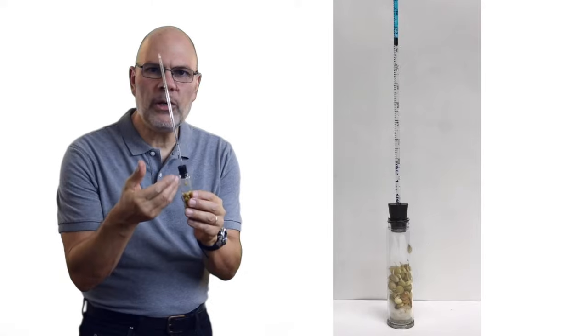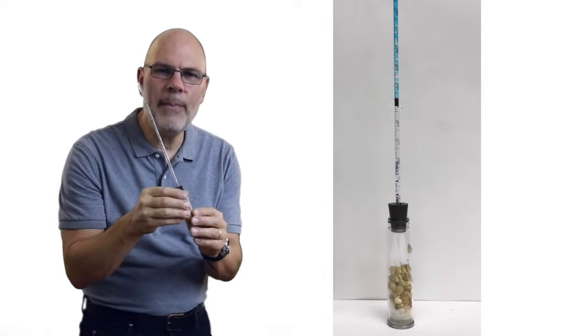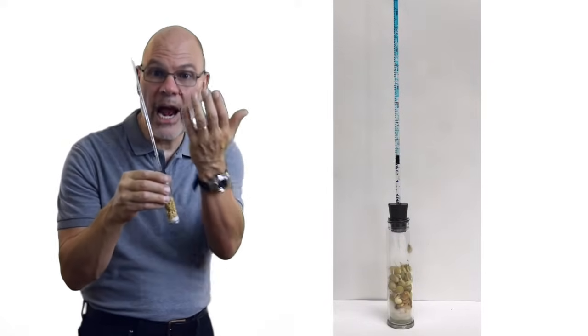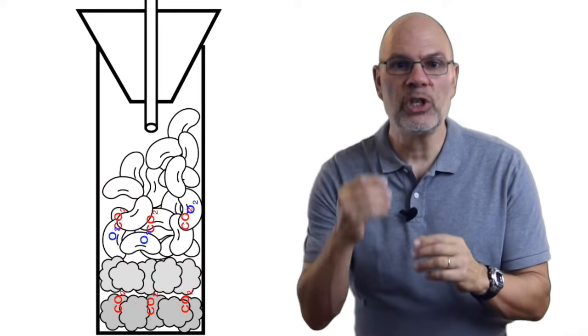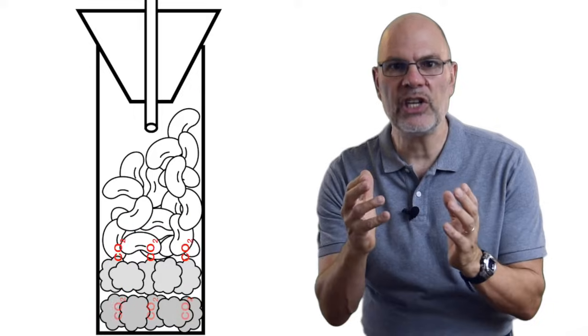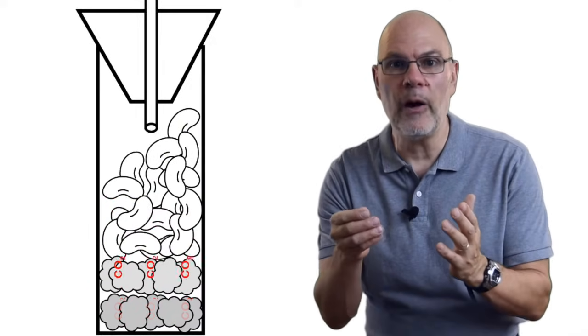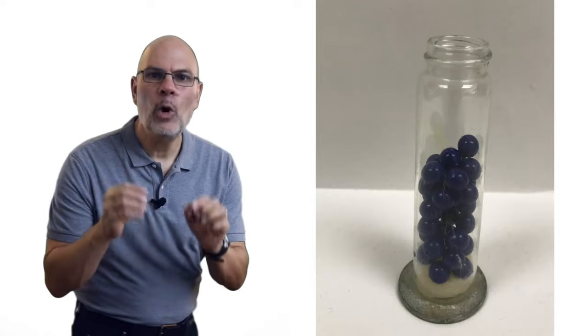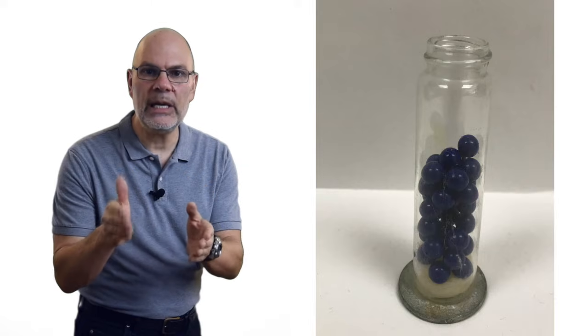But how do we know that it's the disappearance of oxygen that's drawing the food coloring down the length of this pipette? How do we know that it's not gravity or a change in the surrounding air pressure? We need a control. If our assumption is that a respiring organism is consuming the oxygen inside that chamber, then we need to see what would happen if there's no respiring organism. To do so, we build an identical respirometer, but instead of our respiring organism, we substitute an equal volume of something that's not respiring, like these plastic beads.